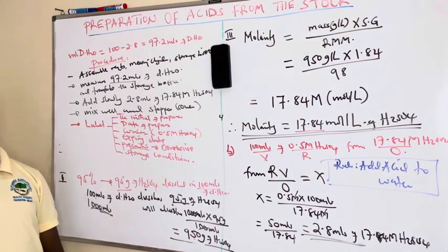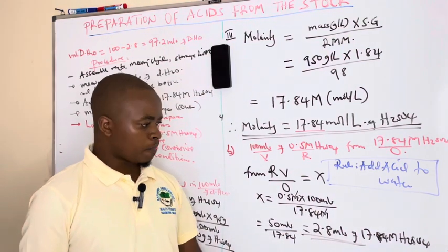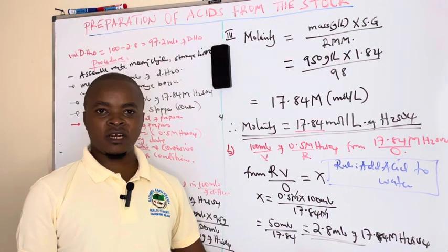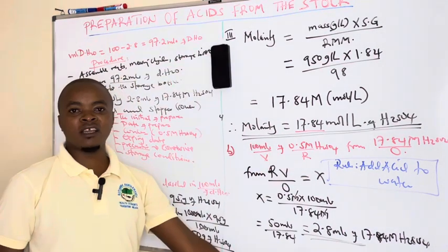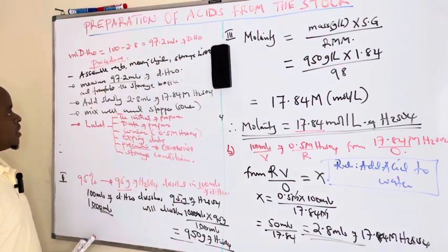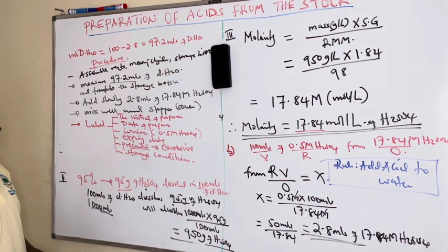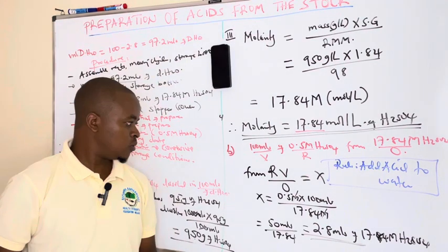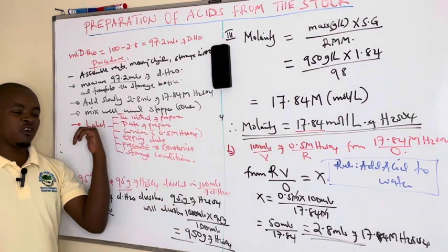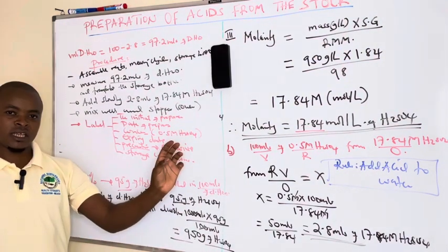Many students, whenever they ask this question, tend to stop on the calculation, and they do not describe the procedure, whereby the calculation takes 5 marks and the procedure also takes 5 marks. So after getting the mils, you have to prepare well. Another thing we have seen many students do is reaching the label part and they just say label, and they do not give the details.